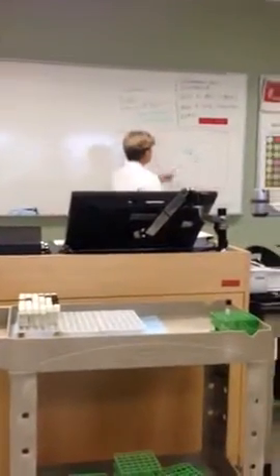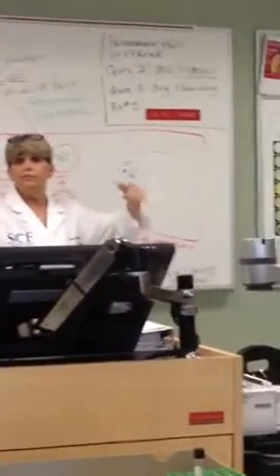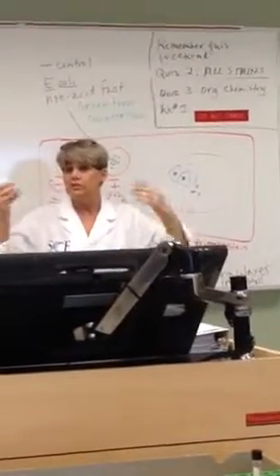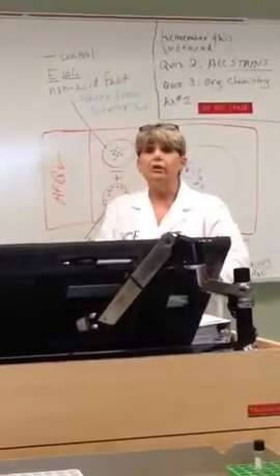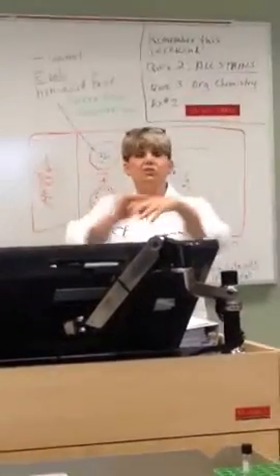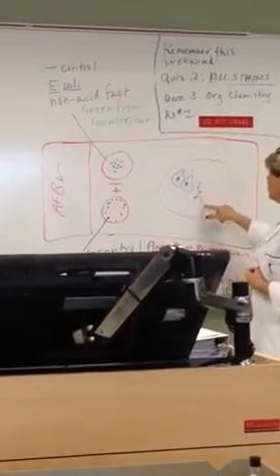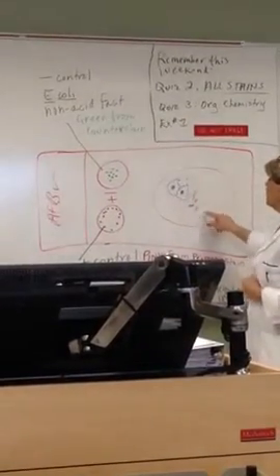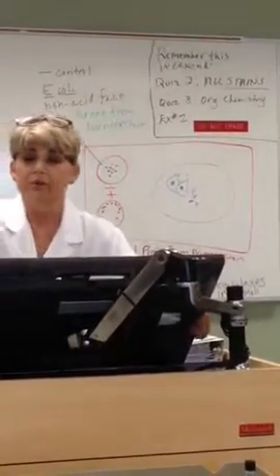When you look at your mouth scraping, you're going to see squamous cells. You must be able to recognize simple squamous epithelial cells that slough off of your skin, or the wall of your vagina, or the wall of your anus, or your mouth, or whatever. And you also have to recognize bacteria that may be there. Okay? That will be a lab final question.